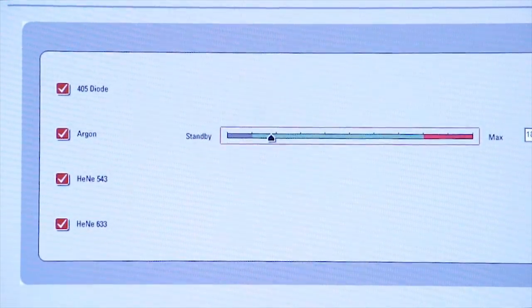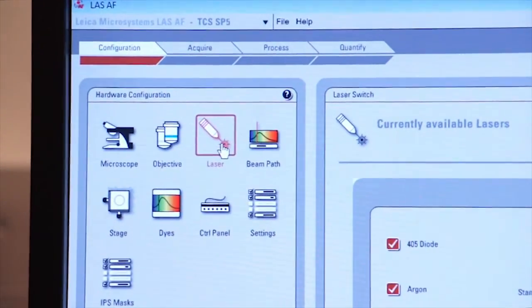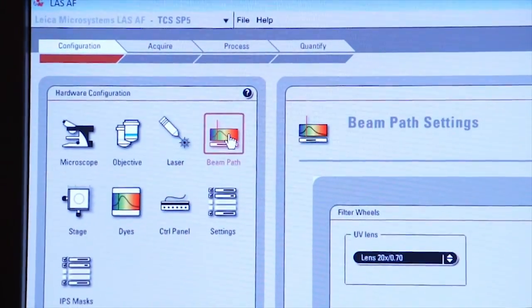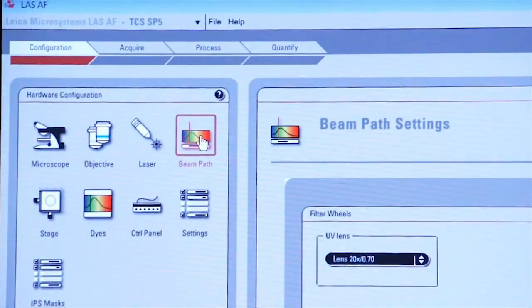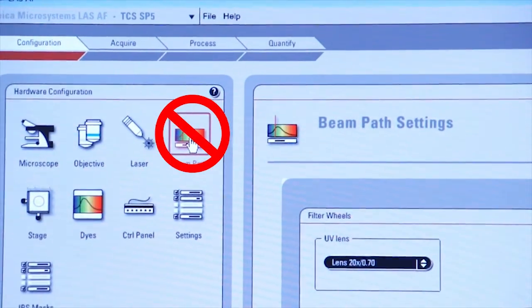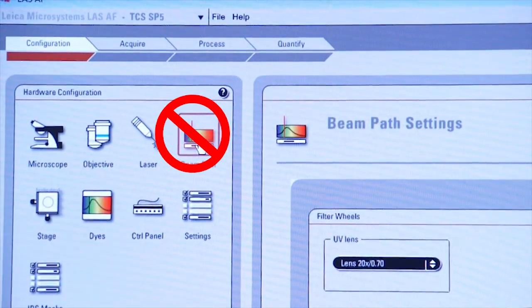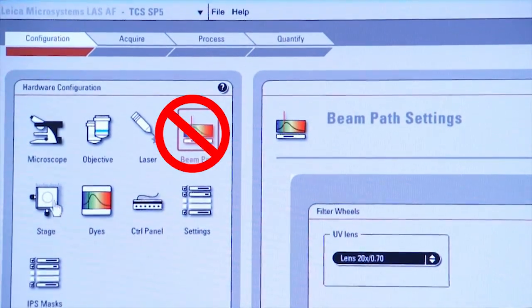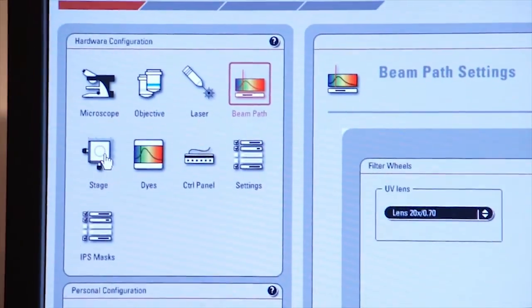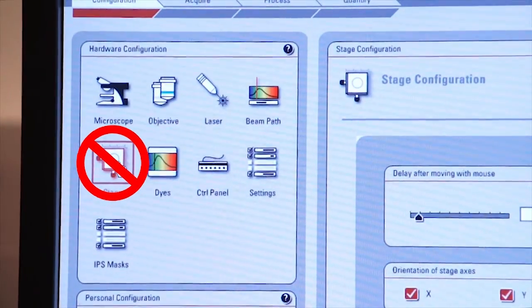In addition to the laser tab, there is a beam path tab. Again, please do not interact with the beam path icon, nor do I want you to interact with the stage icon.